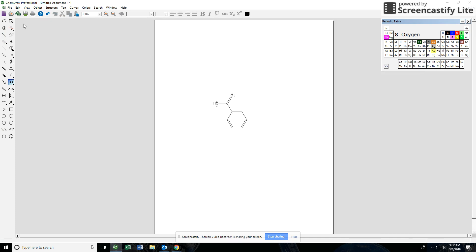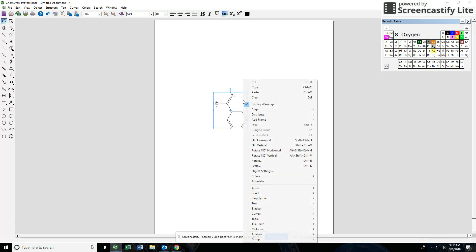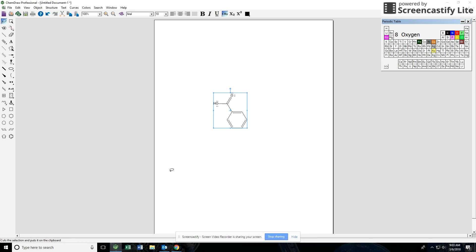Now if you want to put this into Microsoft Word all you got to do is select it with one of your tools up here and copy and paste and then you should be able to put it into a Word document.